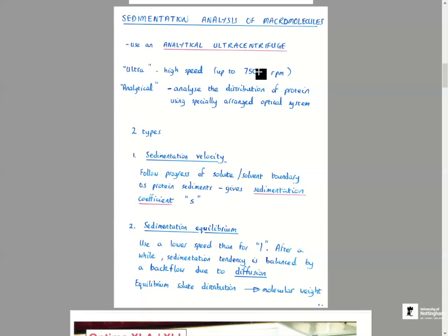Okay? Preparative centrifugation, the separation and purification of materials. Analytical centrifugation for analyzing their sizes and shapes. So we use different types of containers, and we'll show you when we have the demonstrations: for preparative centrifuges, plastic tubes, and for analytical centrifuges, these special, expensive metal containers with windows, quartz or sapphire-based windows, so we can shine light or UV radiation through to do the analysis.